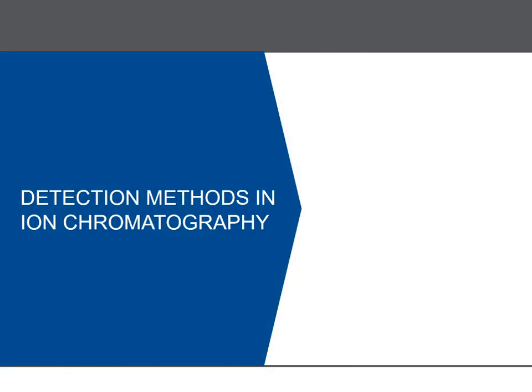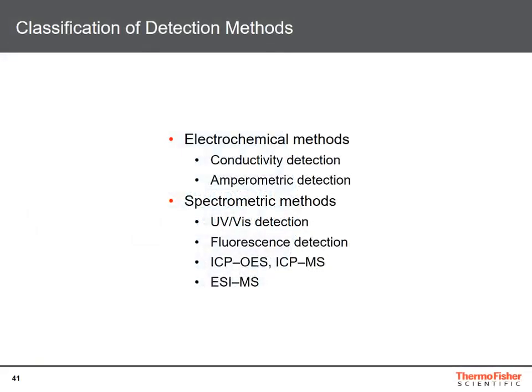The second part of this presentation is devoted to detection methods used in ion chromatography. Let me first classify the most important detection method used in ion chromatography today.